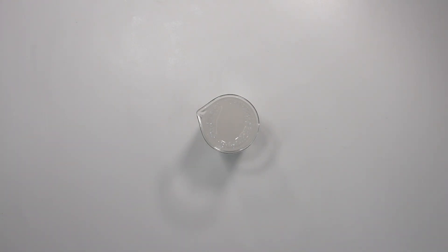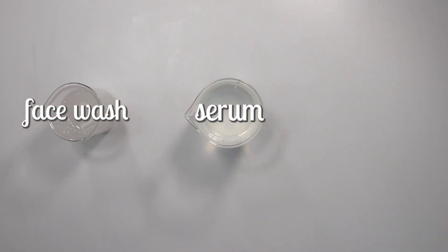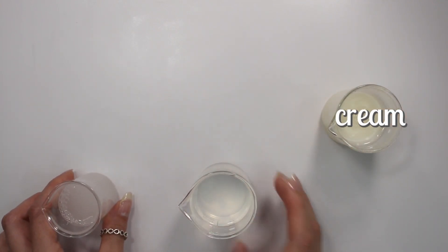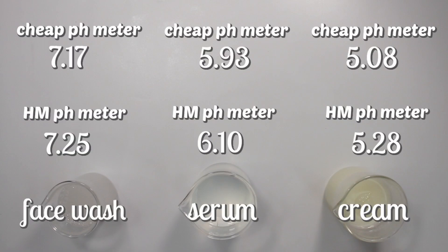So overall, I do think both of these are good pH meters. If I had to recommend one to you, I would totally say the more expensive one. But if you're a beginner and you're not too serious about making cosmetics and you don't really do it too often, then the cheaper one will totally get you by. But the more expensive one has more perks to it. I think it's easier to calibrate. It also has an electrode storage solution, which kind of makes me trust the electrode more.